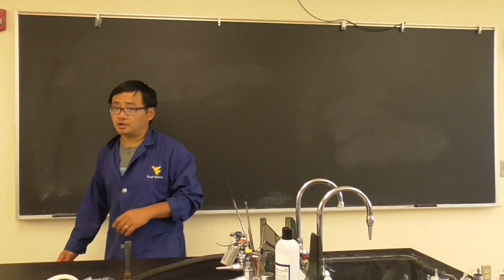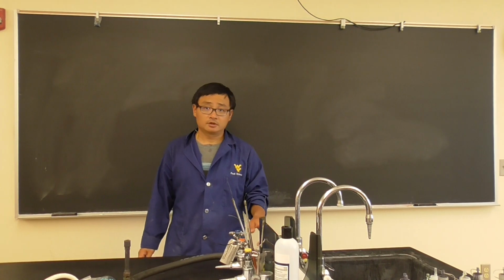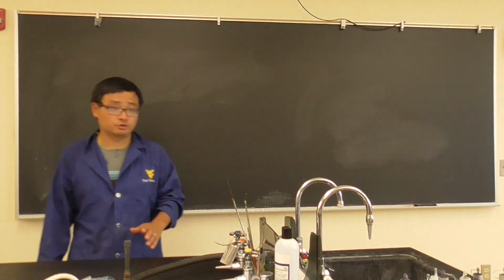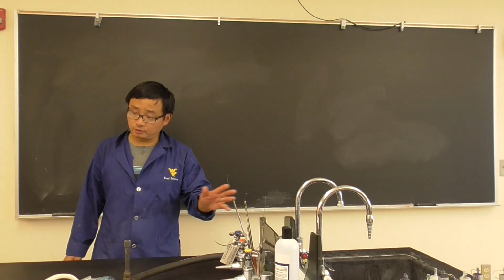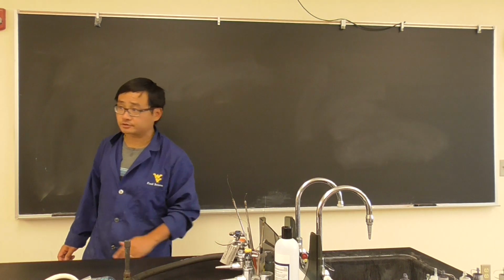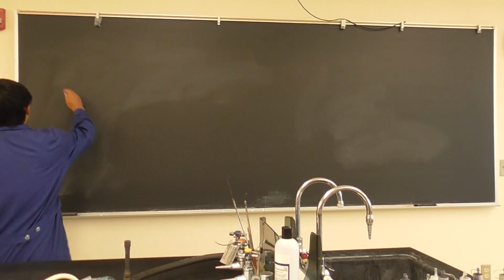Okay, good morning. This is our first AEM341 Microbiology Lab. Since we are doing microbiology, obviously we're going to use a microscope first. So we want to tell you the principles behind that, and you're going to get a chance to practice. Okay, so what is a microscope?